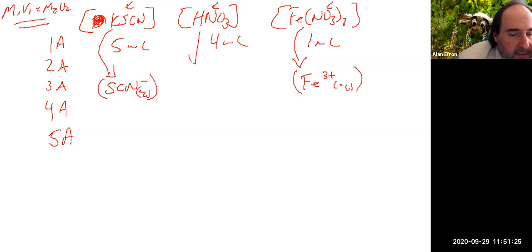Nitric acid is used here as a solvent. It is used very much like we use water in a lot of experiments. So in this particular experiment, instead of using water as the solvent, they're using nitric acid as a solvent. If you remember in the kinetics experiment in those test tubes, they put a certain amount of deionized water in there. Same idea here, the nitric acid is being used as the solvent.